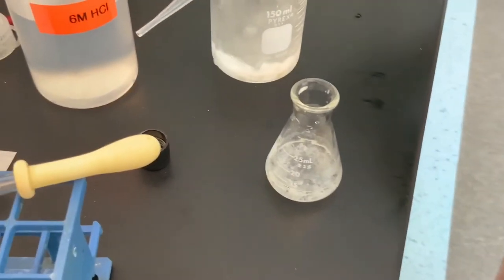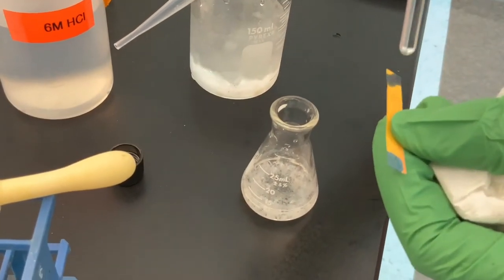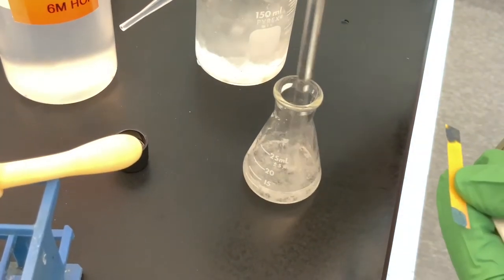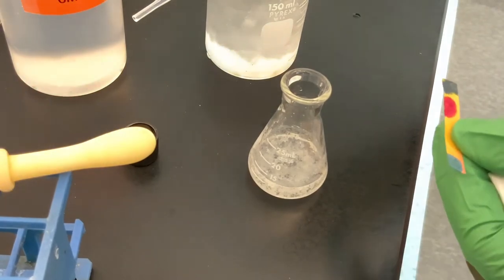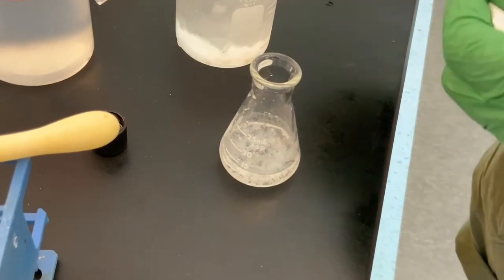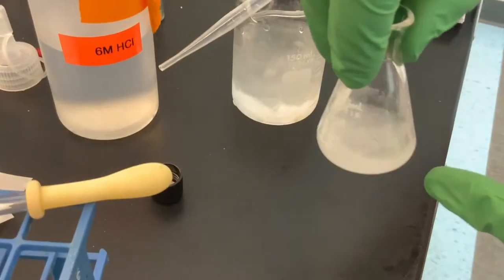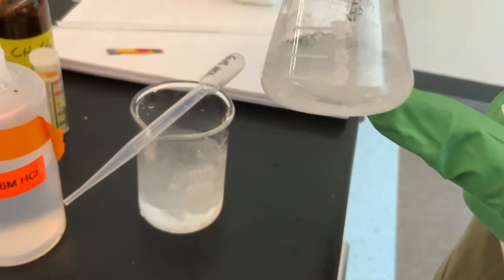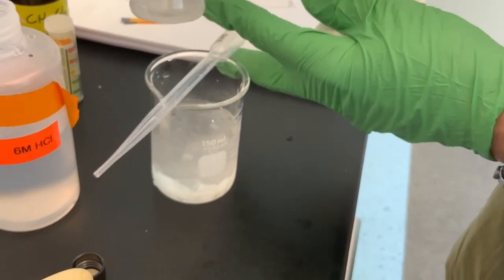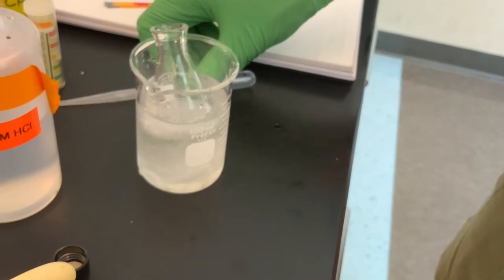So let's test that pH now. Really? Still that basic? Oh, no, of course not. All right, so now we're in acidic territory. And this is what we're looking for. All right, and obviously this is acidic because we've got the benzoic acid precipitating out there. All right, and so we're gonna just leave this on ice for a little bit, and then we will vacuum filter it just like we did the benzocaine.